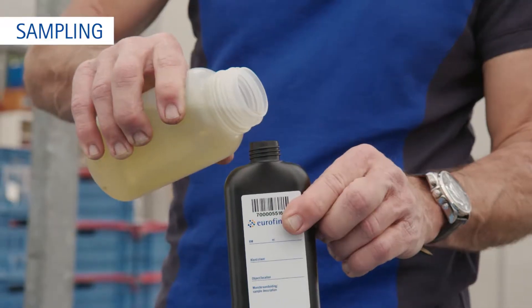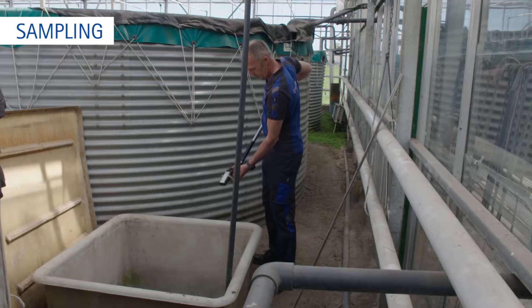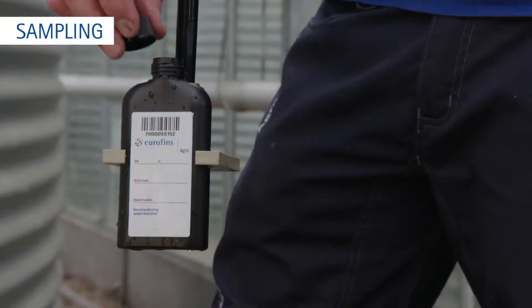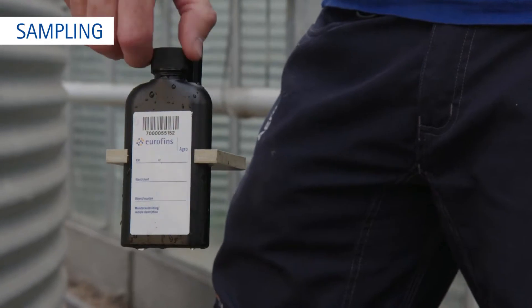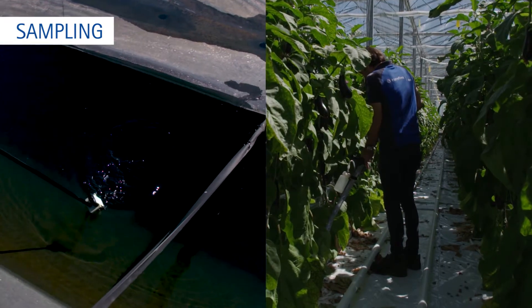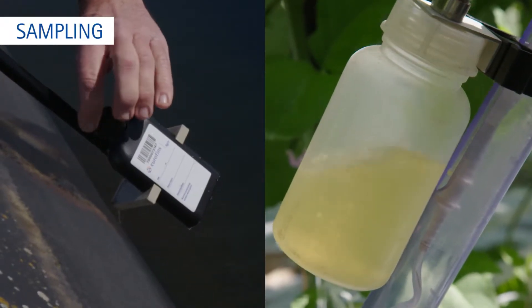Make sure the bottle is completely filled to avoid fluctuation in pH. An alternative is to sample the drain water, but only do this when enough drain water can be collected. Collect the sample from the drain water collection point. For an optimal result, always sample both basic water and drip water, and drain water.